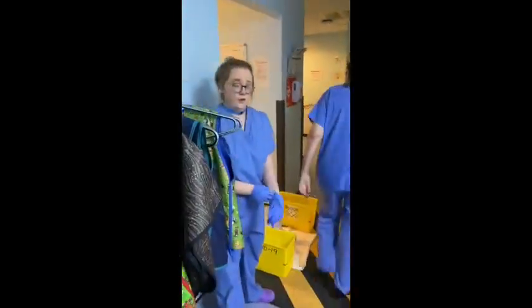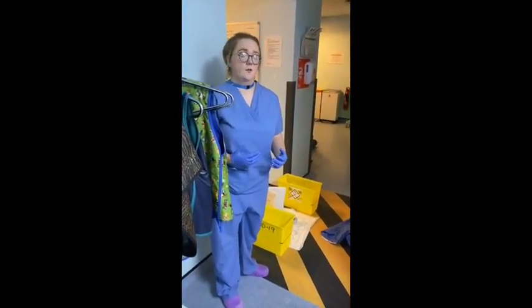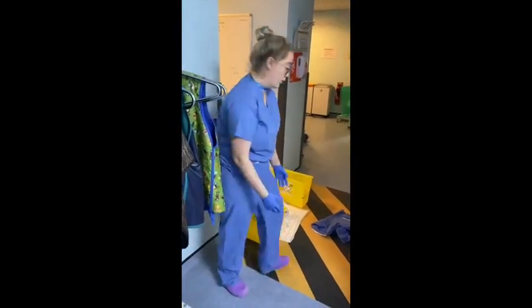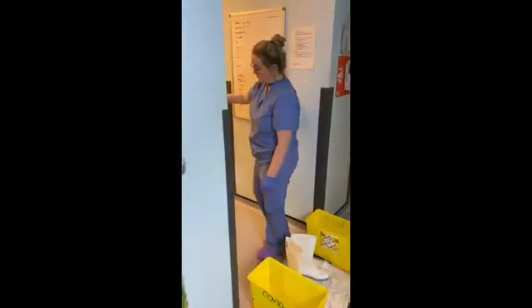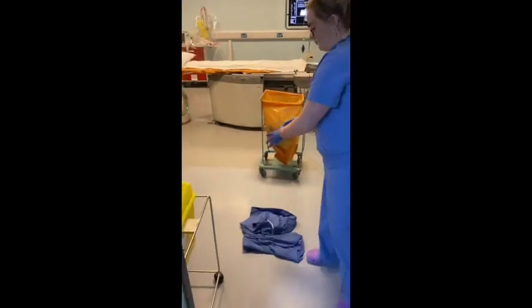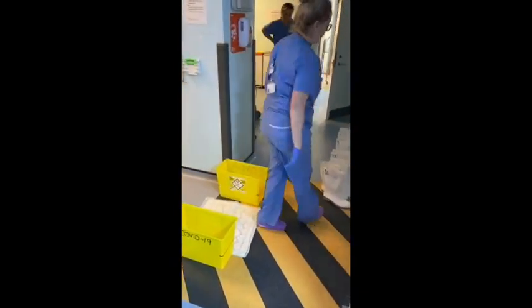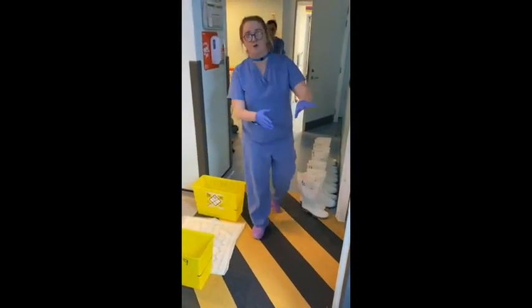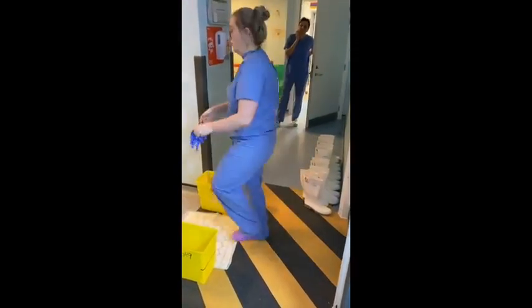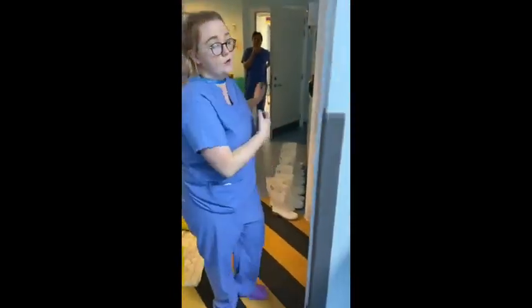The last person that's in the lab, this is going to work basically on a volunteer system, where the last person in the lab will gather all the scrubs, place them into a bin that will be here, and bag up the bin. And as well, we'll remove all the wellies once they've been dipped into the bleach, to put them back along the wall, as so. And then wash your hands again, so taking off your gloves, binning them, washing your hands again, and then you can leave the lab as well.